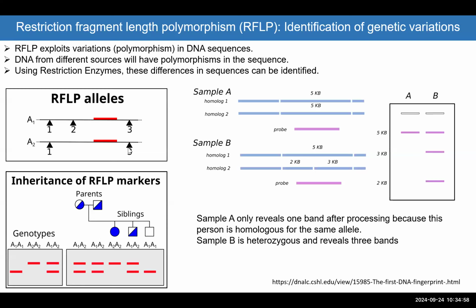So the probe we added was at the site where we can have either one fragment. So if we have allele number 1 and you cut with the restriction enzyme, you will have only this guy, which is a smaller size. And obviously, what's happening is when you cut allele number 1, it will be cut into 4 fragments.